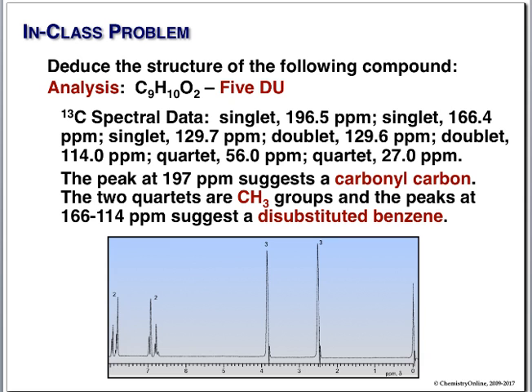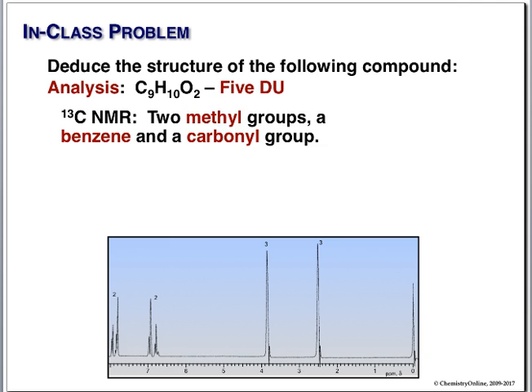Now, if we look at a proton NMR, we know that right away, don't we? Look down here in the region between 7 and 8. What do we have? We have 2 doublets. Now, what did 2 doublets down there tell us? That's 1,4 disubstitution. 2 things at positions 1 and 4. 2 doublets on our ring. And we have 2 isolated methyl groups.